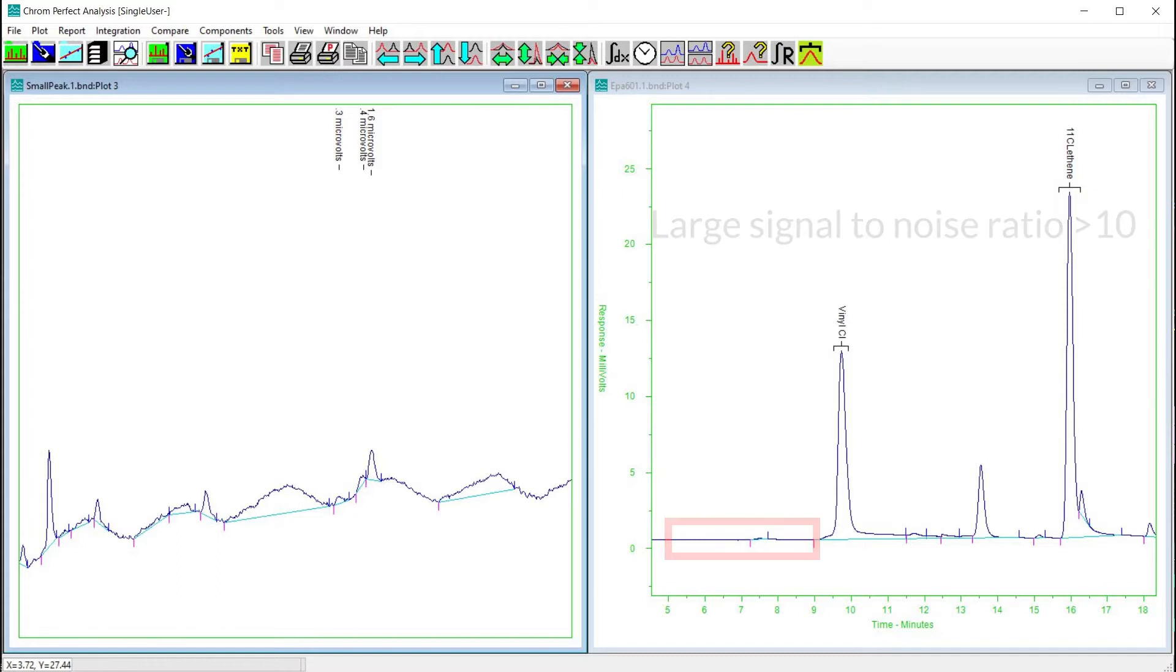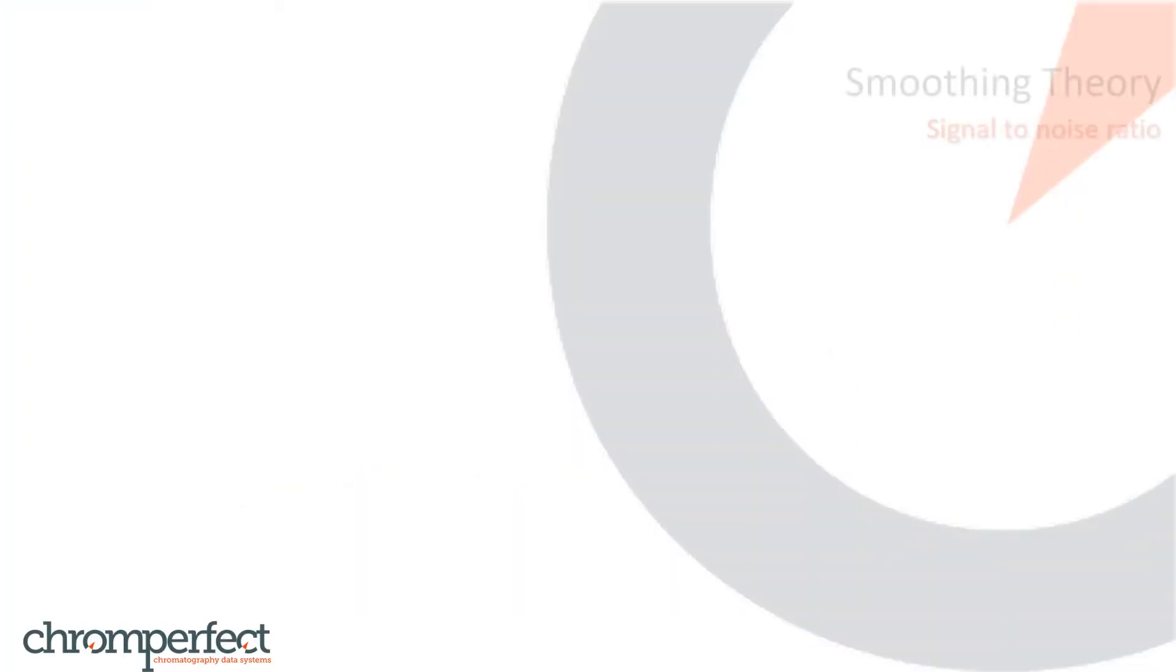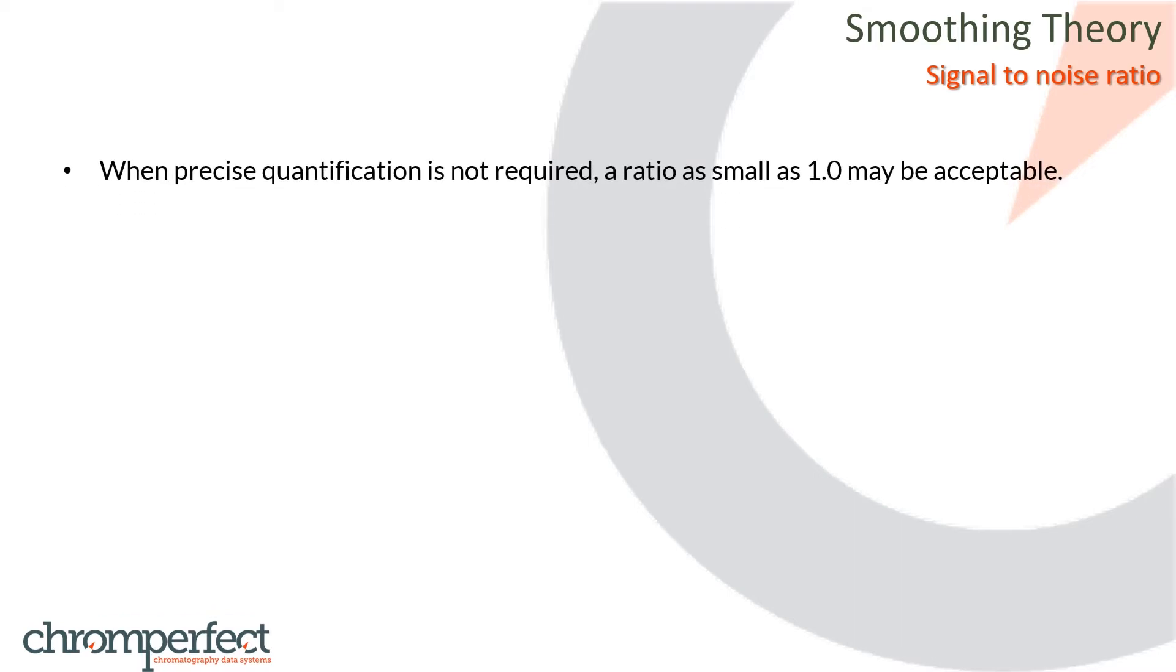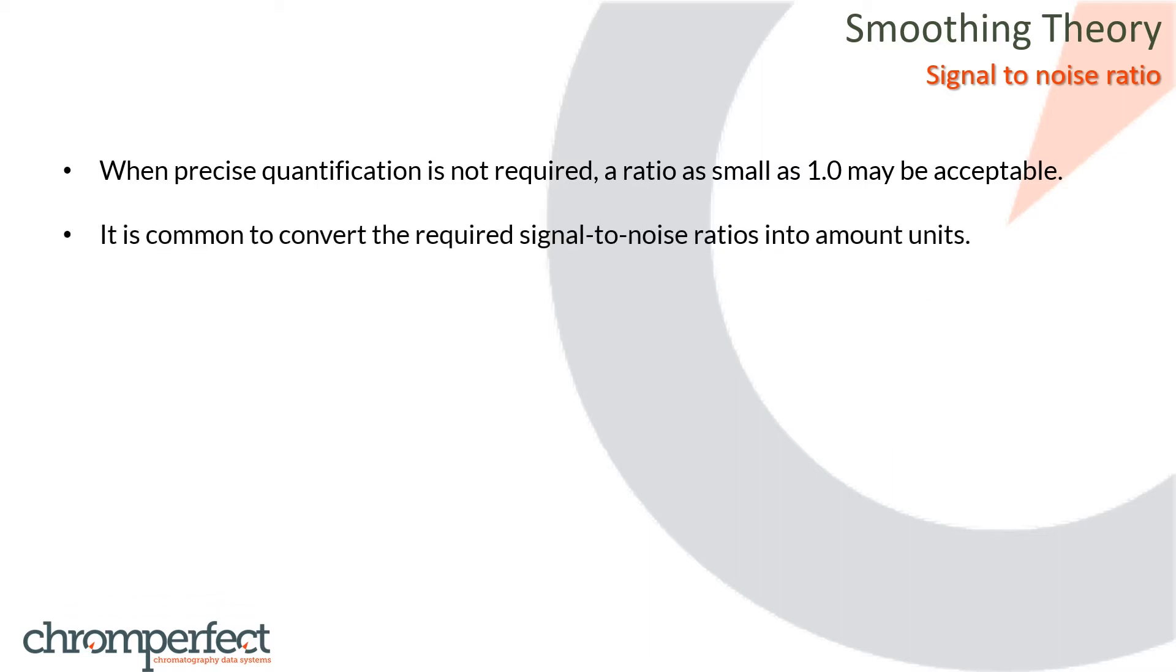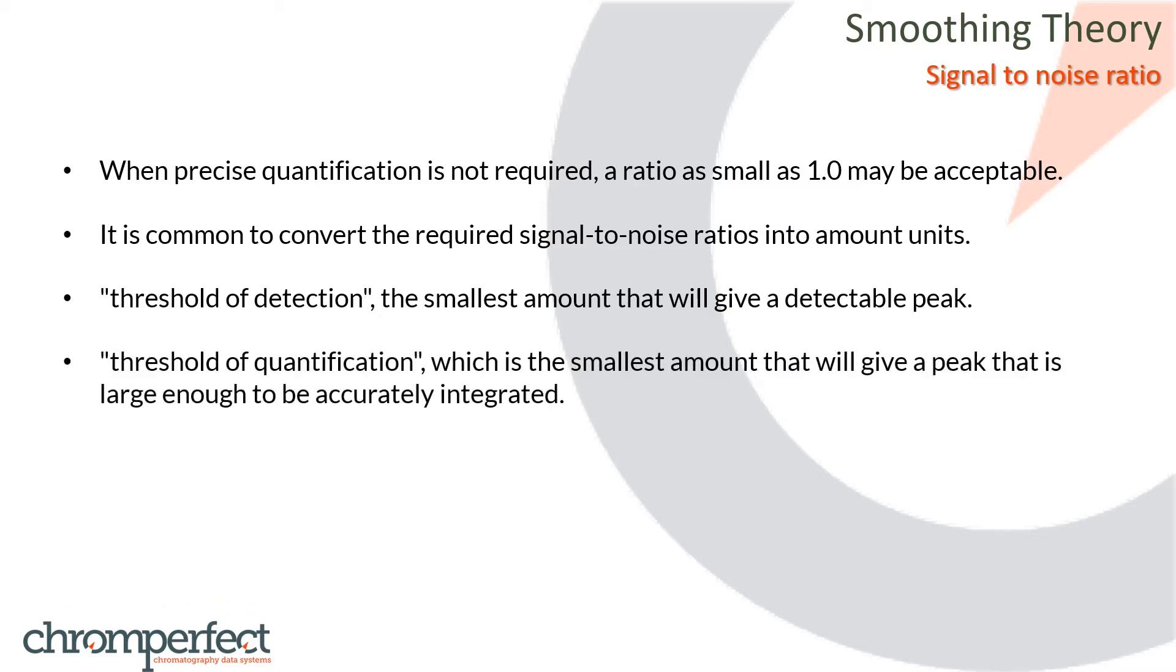When samples are large the signal-to-noise ratio is also large (greater than 10) and detector noise is negligible. As the size is reduced the signal-to-noise ratio diminishes and detector noise becomes progressively more significant. Eventually the noise will prevent the analyte from being detected and quantified. What constitutes an adequate signal-to-noise ratio depends on the purposes of the analysis. When precise quantification is not required a ratio as small as 1.0 may be acceptable. Because the several analytes in a chromatogram may produce greater or lesser detector responses and because chemists are used to thinking in terms of amounts rather than microvolts, it is common to convert the required signal-to-noise ratios into amount units. In this way each analyte may be assigned a threshold of detection, which is the smallest amount that will give a detectable peak, and a threshold of quantification, which is the smallest amount that will give a peak that is large enough to be accurately integrated.